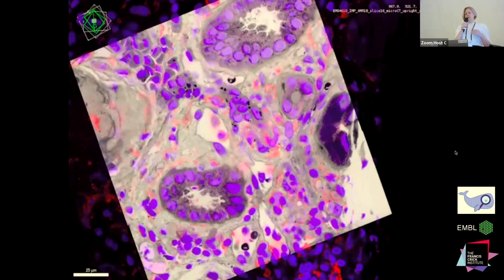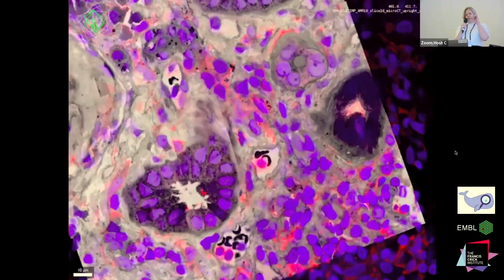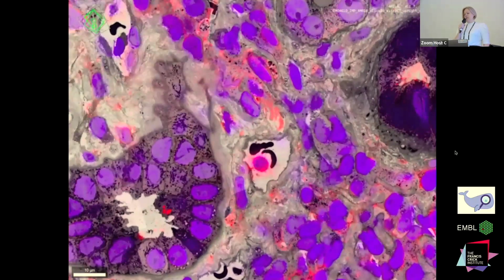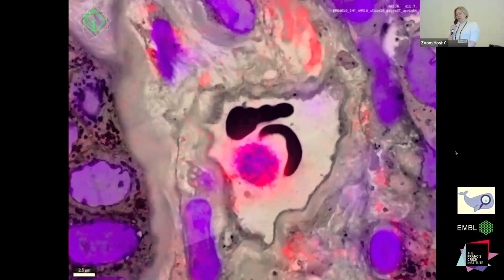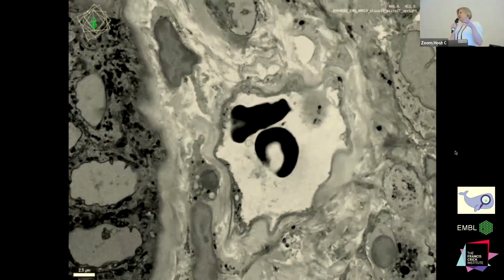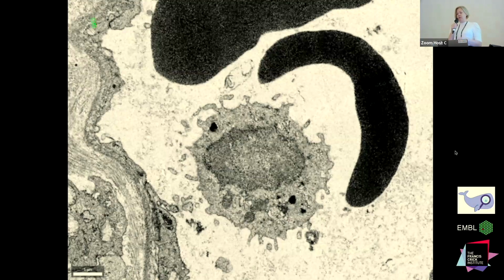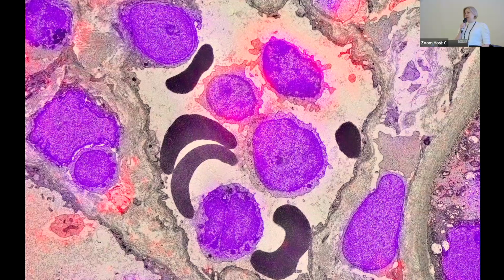The biopsies come back to us and we immunolabel them. The red here is the immune cells. And then we take those slices and we send them over to Yannick Schwab's lab at EMBL Heidelberg, who's in charge of speeding up our volume EM. And what you're seeing here in the Zoom, which I didn't feel brave enough to do live, but we can use MoBIE to access the data remotely through a web server, is individual immune cells, which we can now say the red ones are CD16 positive immune cells, and the ones without red are immune cells that are not CD16 positive. So our correlative approach is allowing us to target, but it's also giving us cellular identity.